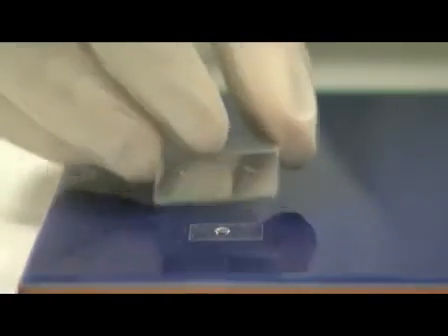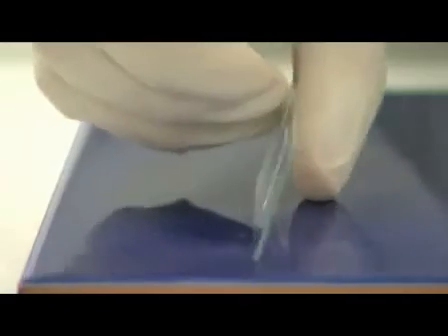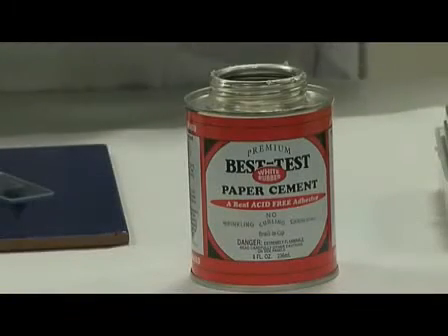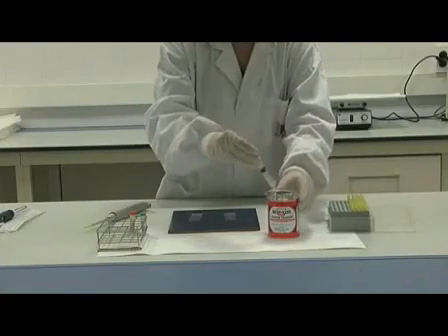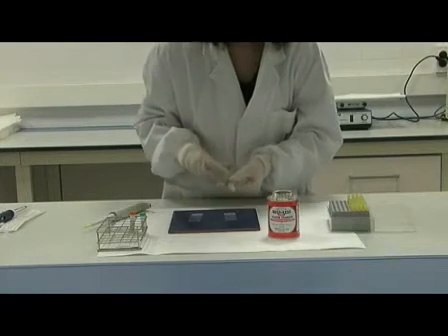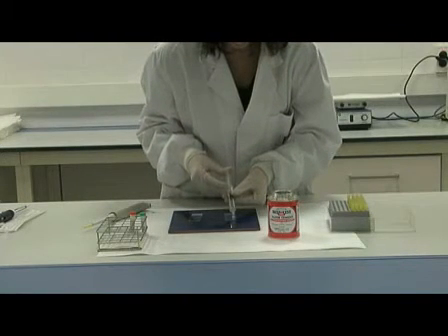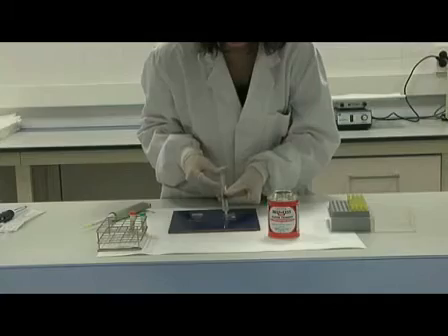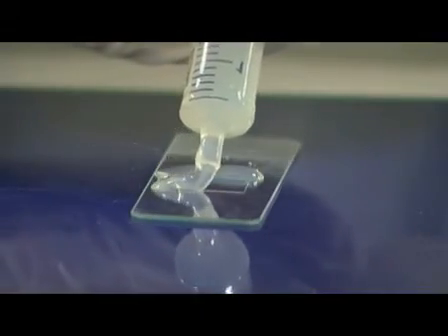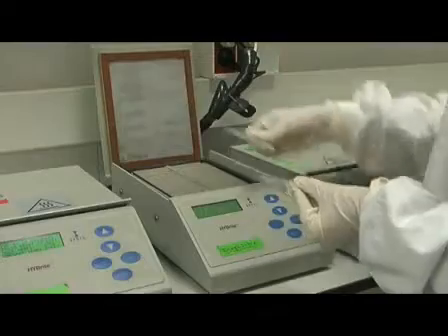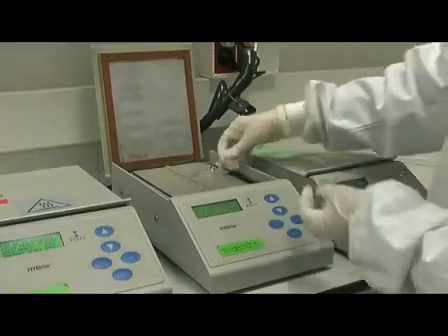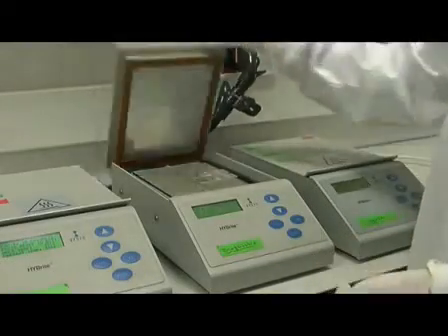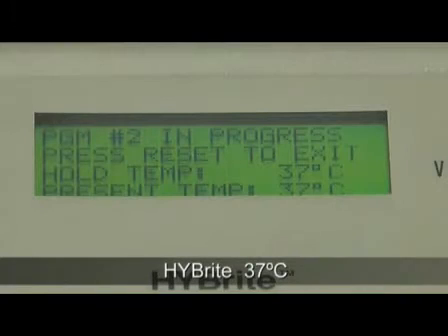The targeted region must be covered with a cover slide and sealed with rubber cement. Then, the slides are ready to be placed into the hybridization chamber, pre-warmed to 37 degrees C and incubated at that temperature for 6 to 24 hours.